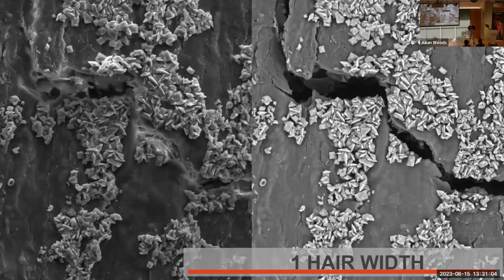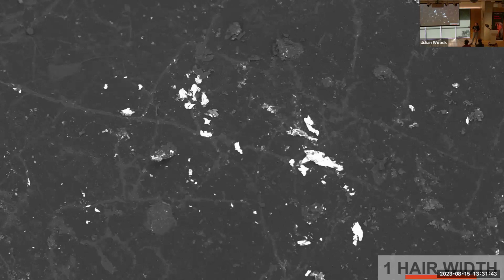But if we move to something that might have a bit of different elemental makeup, we can see on the left, secondary electron, there's not too much differentiation between different structures. But on the right, you can see that this crystal structure is definitely made of something different to the grass mat that's behind it. So this is some salt on the grass mat surface, and this could inform us whereabouts a sample might have been located in terms of if it was on the coast or in different mineral areas around the space.